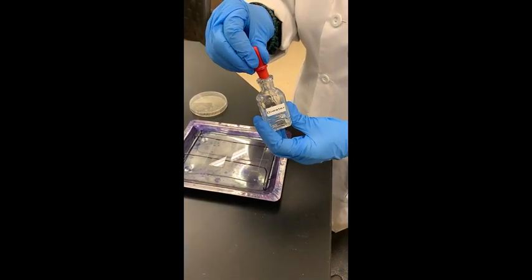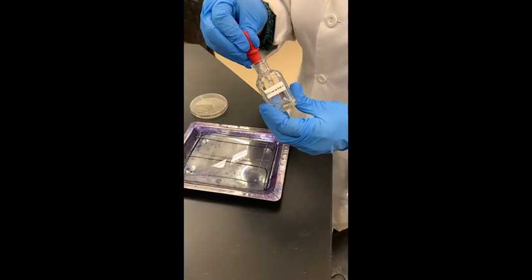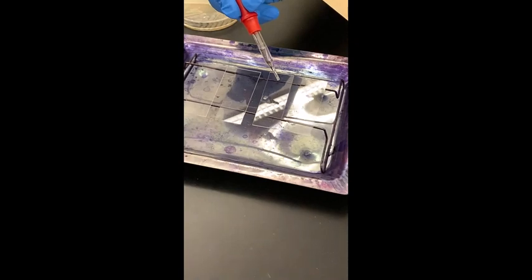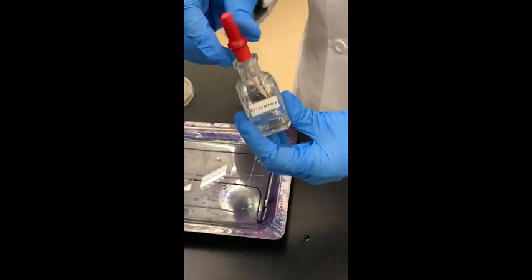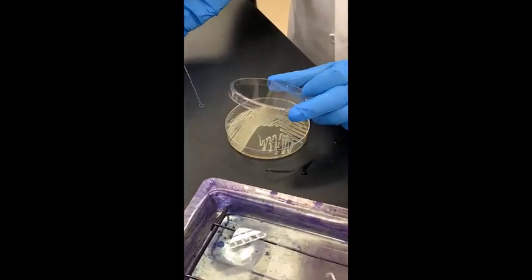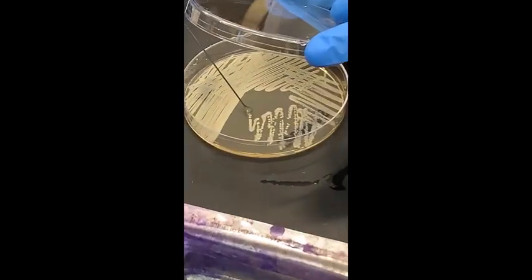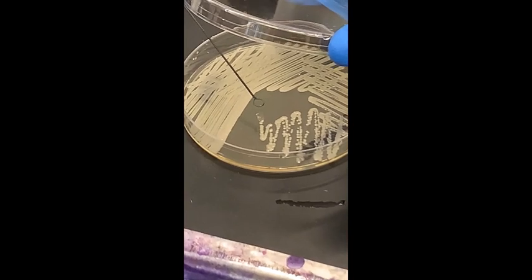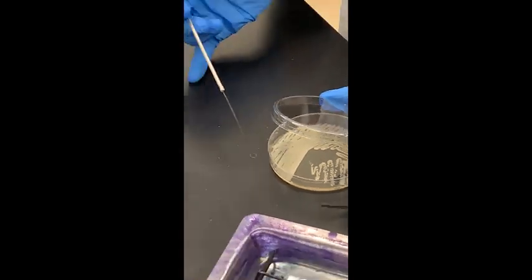If you're working from a solid culture, a plate or a slant, first put a very small drop of sterile water on the clean slide. Then, using a sterilized inoculating loop, aseptically transfer a very small amount of bacteria into the water and disperse them well.